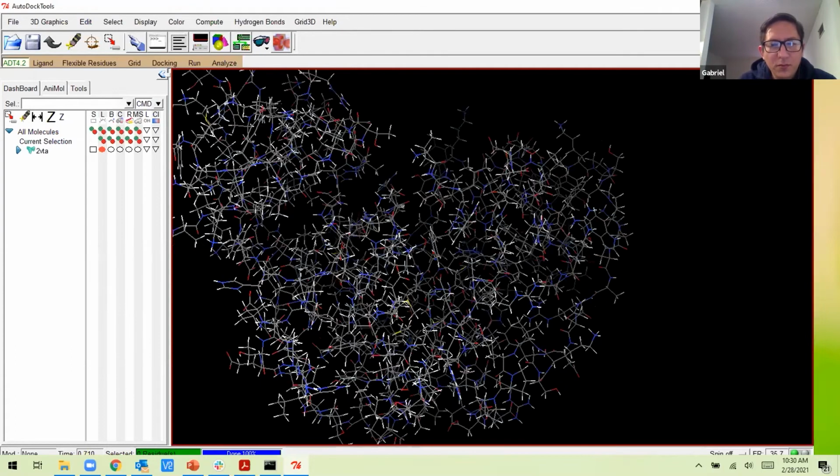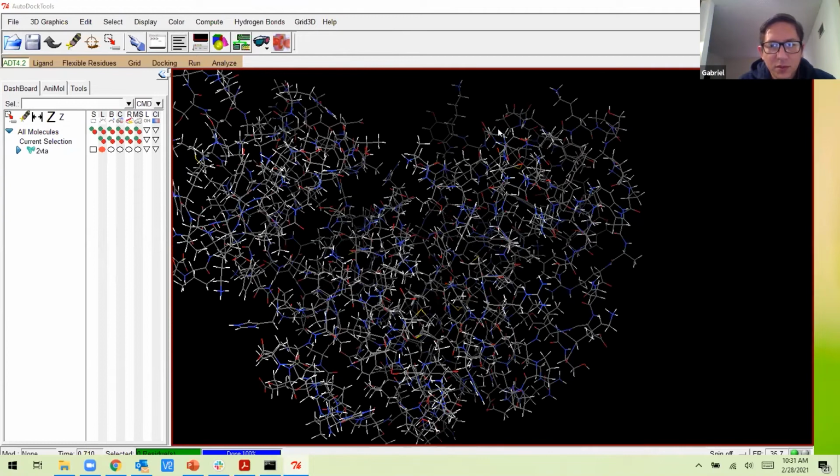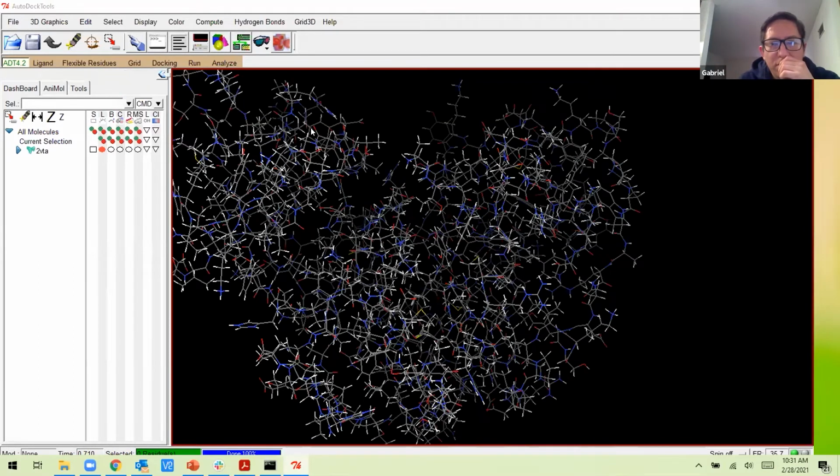So we have to prepare the ligand. How do we add the macromolecule? You go to grid, macromolecule, open, and then you select your PDB file. Marcelo? Okay.